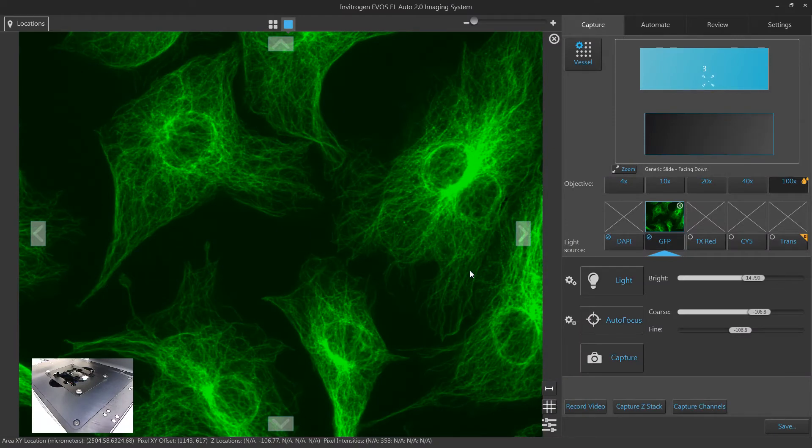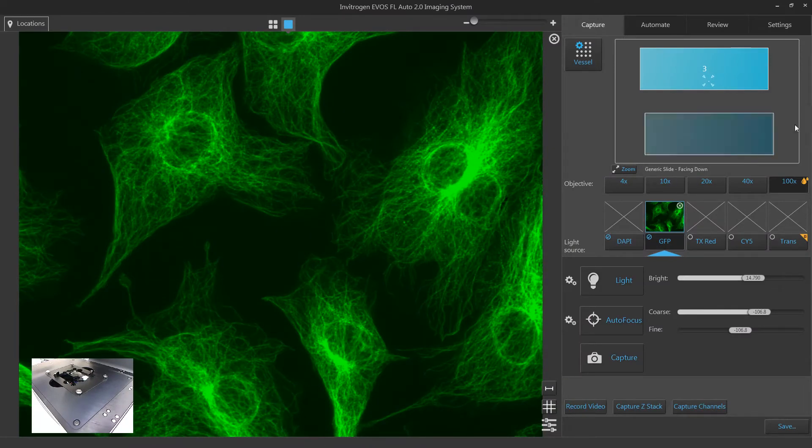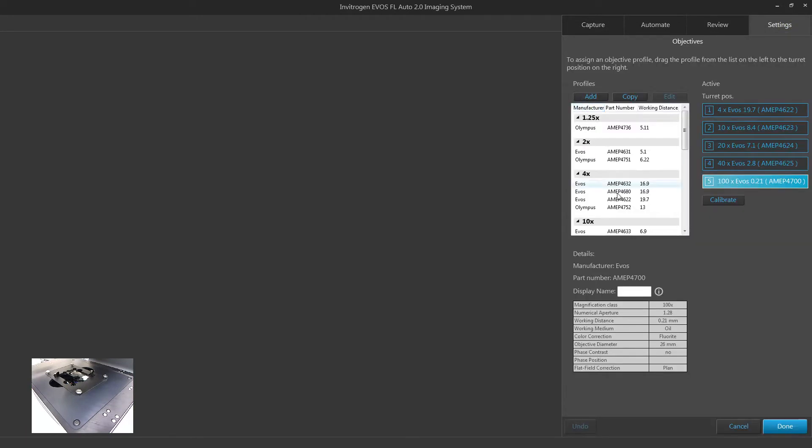Be sure your oil objective is specified within the settings tab under the objectives menu.